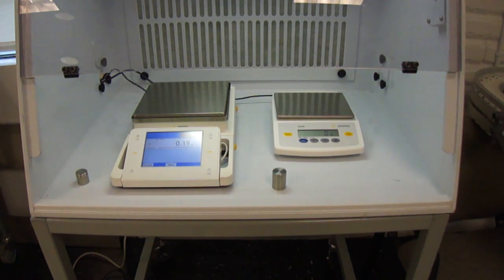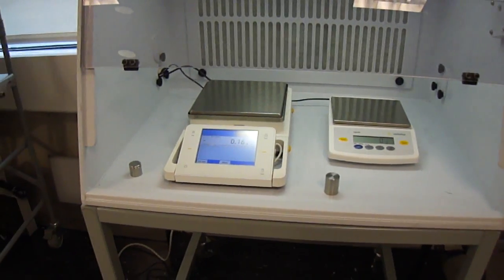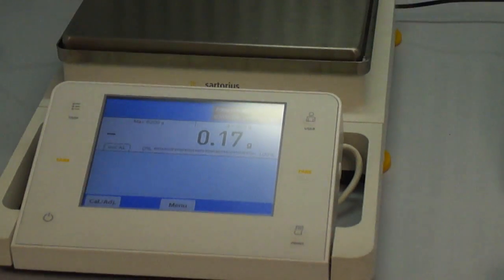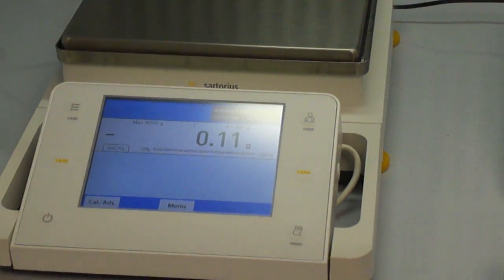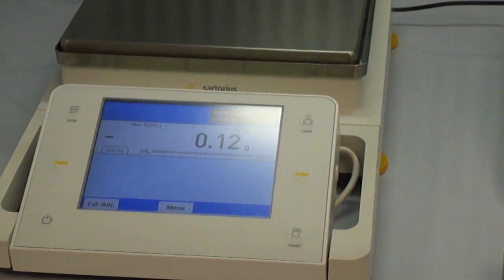We'll be using the lower range to see the drift as you can see right now. So what I'm going to do is show you the differences between the QGrid and also the two different balances in the resolution. So you have the QGrid just fluctuating as you can see. Well it's a two place balance, all the airflow going through there. You would expect it.